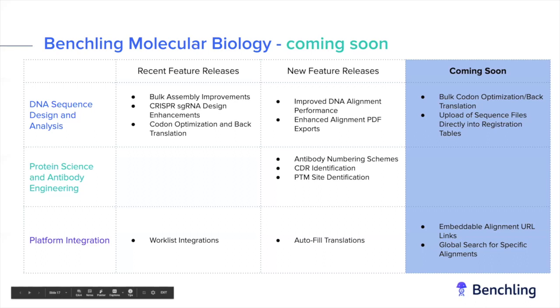I will also mention that an additional parameter that we are looking to expose, but this might be a little bit further down the line, is around introducing cut sites. Right now, we have an ability to preserve existing cut sites or make sure that we do not introduce certain new cut sites. The obvious next addition to that is being able to actually specify, I want to introduce this cut site at a particular area. And I believe it's a parameter that we can expose, and we just need to figure out where that fits into the roadmap here.